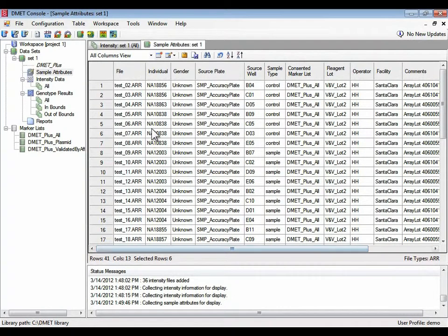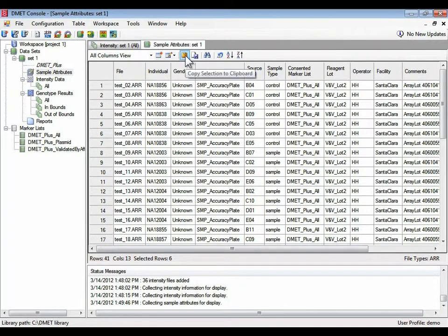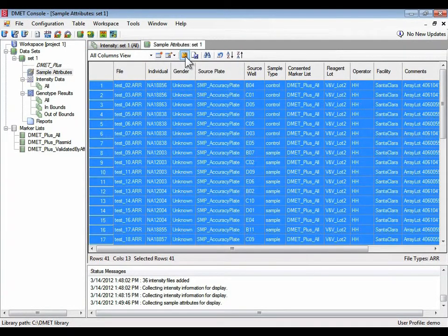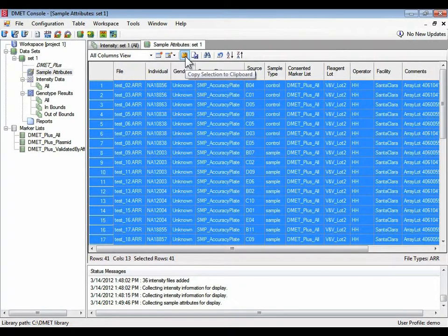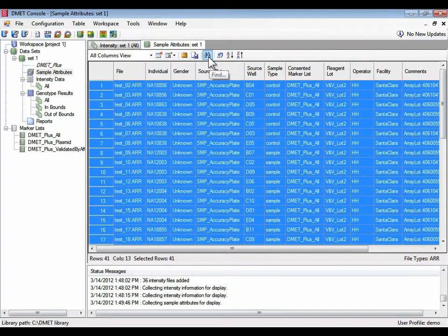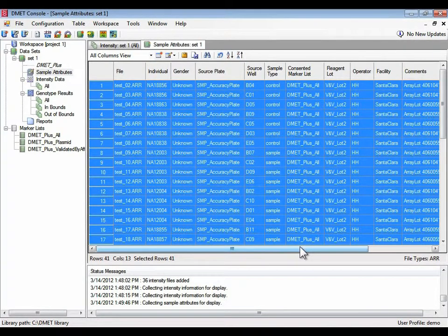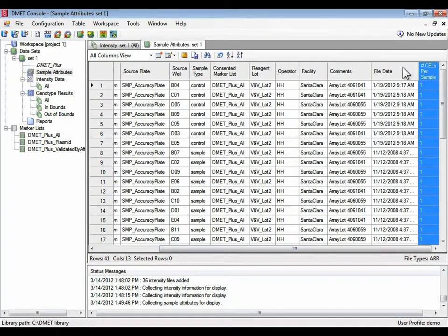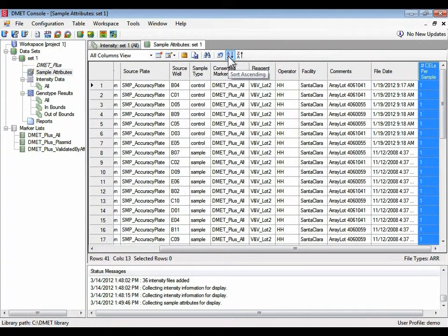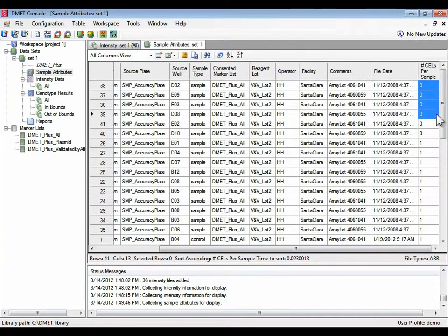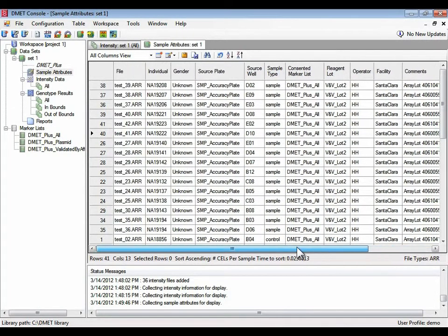I'm playing around in this table. I just want to point out some other things you can do with this table. You can basically copy this information to another source by either copying it directly to the clipboard, you can save the entire table to a file, you can search for information, or you can do sorting. So if I wanted to find quickly the samples that were missing cell files, I could sort in ascending order on the column that I selected, and that will highlight those quickly.